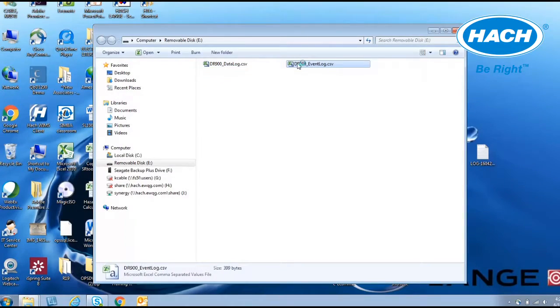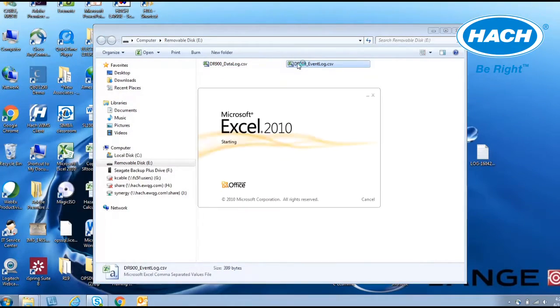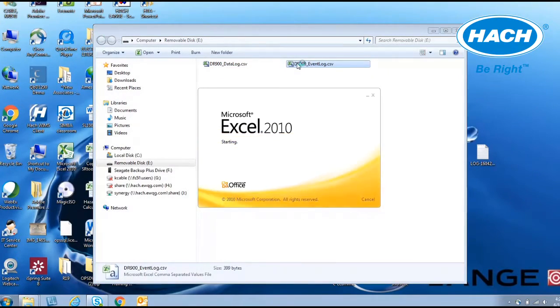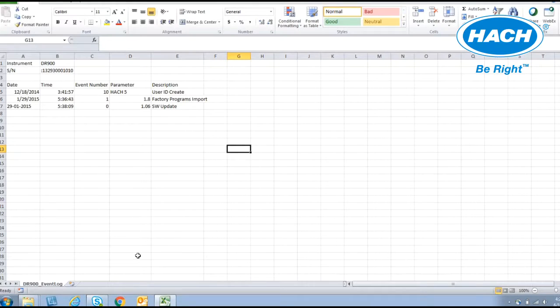The event log will capture important changes to the meter such as software updates, the creation or deletion of user programs, and the addition of a favorites program. Each event will have a date and time stamp and an event number.